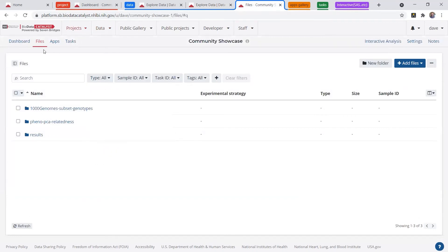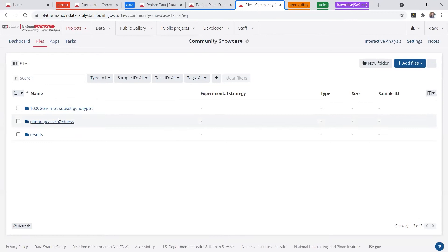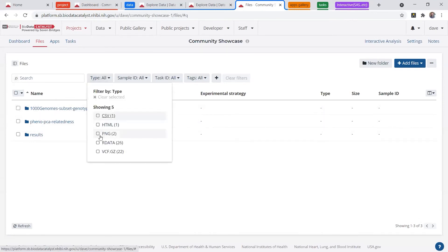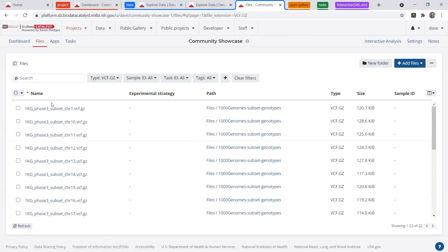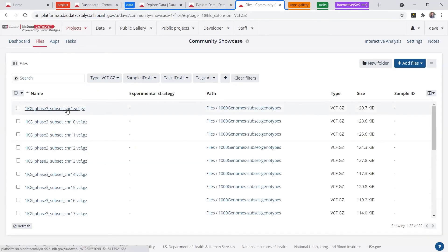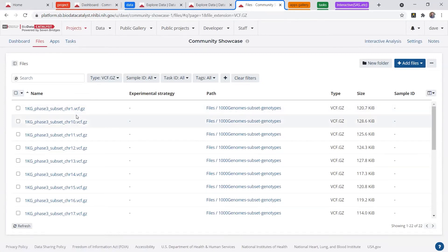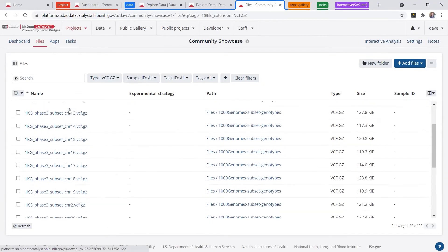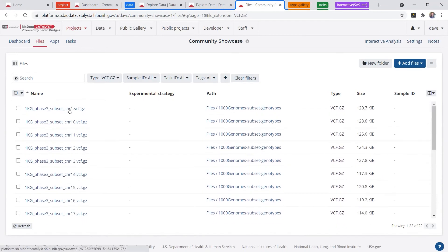So back in our project, we have in the files tab, I've added some folders so you can organize your data in folders. You can search by file type. So I've added 22 VCFs that are based on the 1000 Genomes open data set. These are just subsets of some of the genotypes here.